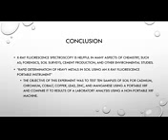In the research experiment, the goal was to test for metals in 10 soil samples using a portable X-ray fluorescence spectrometer and compare the results to the non-portable X-ray fluorescence spectrometer used in a laboratory. The portable X-ray fluorescence spectrometer was found to be a quicker, more efficient method.